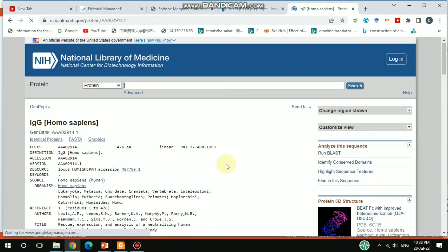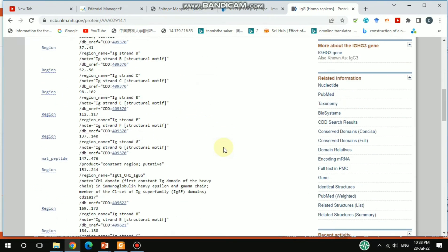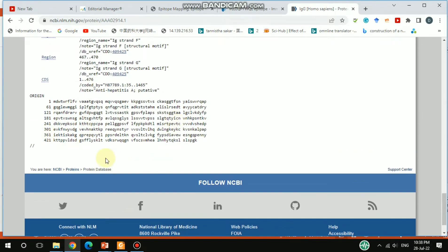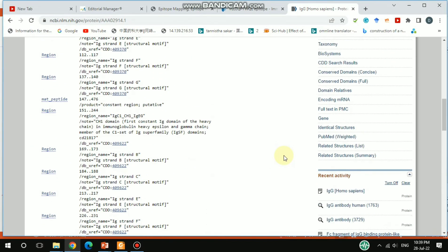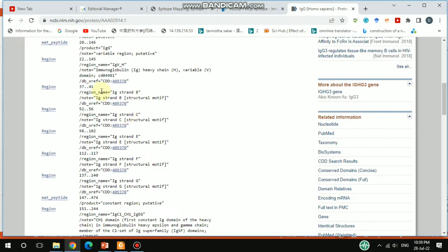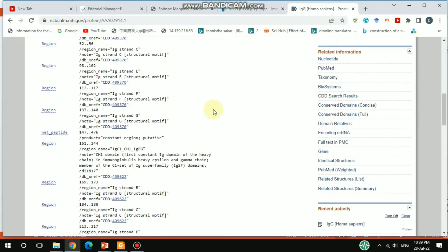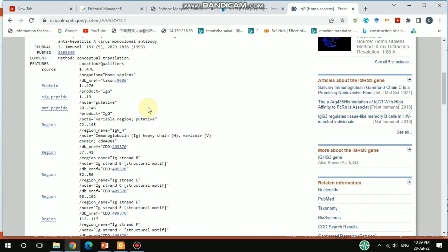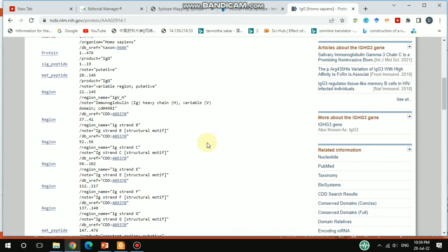You'll get detailed information about this IgG antibody. If you scroll down, you can see the amino acid sequence — this IgG antibody is around 470 amino acids long. If you look carefully, you can see the signal peptide from position 1 to 19. Going further, the mature peptide from position 20 to 146 covers the variable region part.